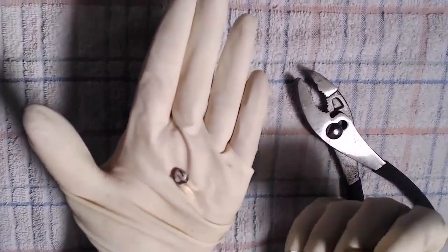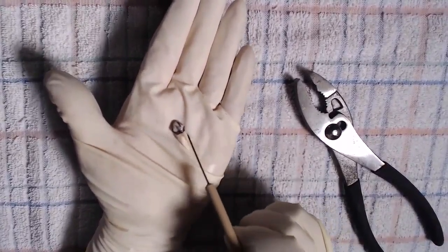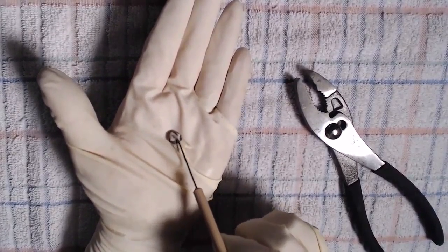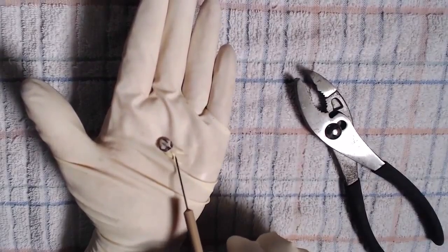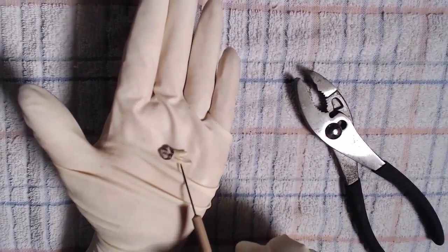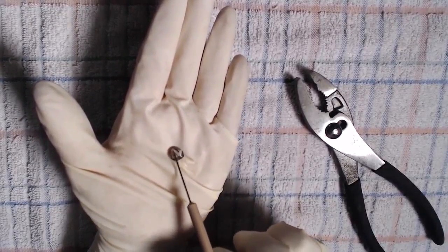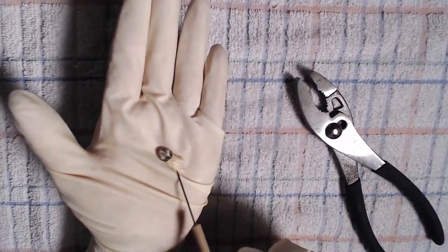All right, so right away you can see that this tooth here has the crown up top, and then the root on the bottom, and then the crown is covered by this white enamel, whereas the root is covered with cementum.